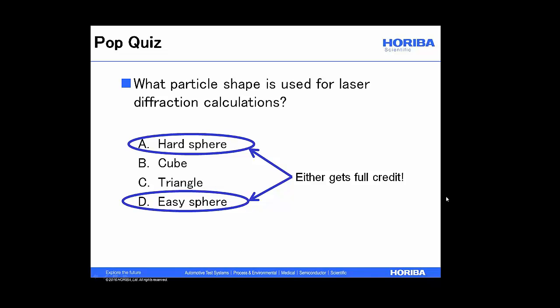Anyway, going back to that, it's risk-based. Instruments do not tend to drift over time. Generally, you're not going to see much change, so you might want to stretch that out, particularly if you're in a less critical application. Some people have a service contract, and as part of the PM we confirm instrument performance.